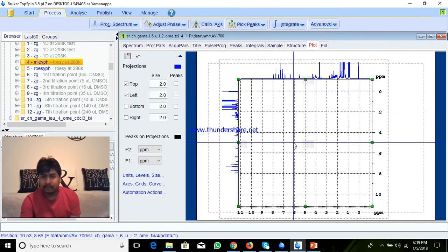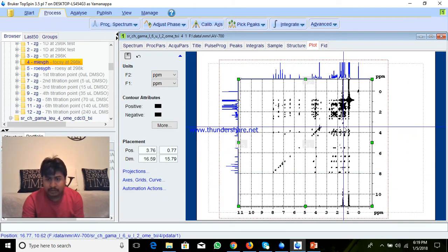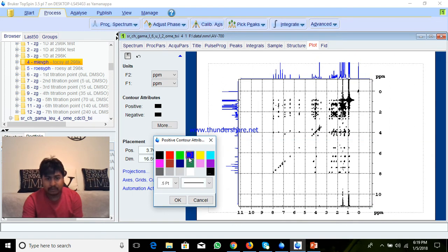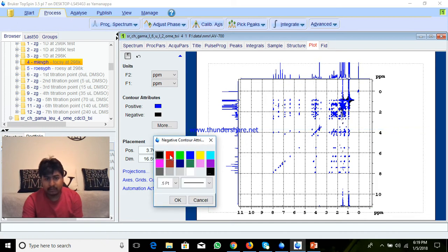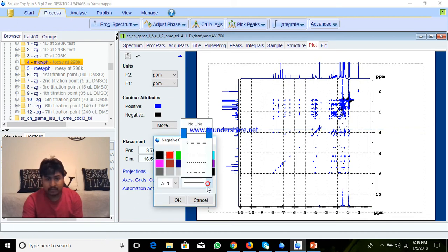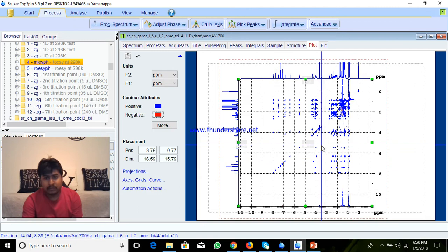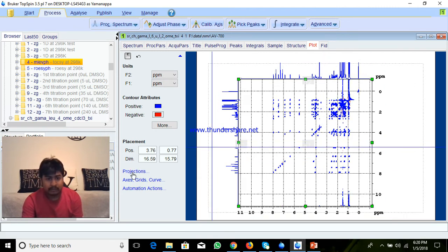In the Axis settings, you can give the limits — how much you want to extract the spectra. Here it's minus 1, so I will give 4 ppm to 9 ppm. So if I give 9, it will expand like that.